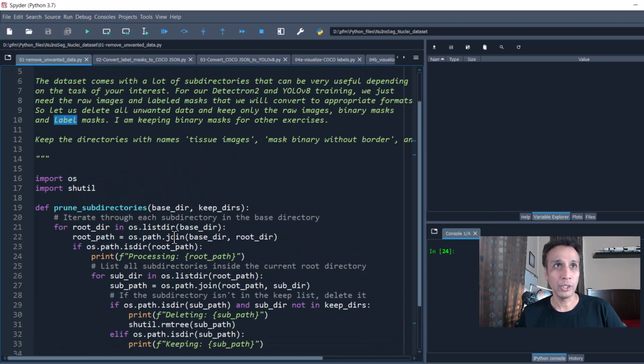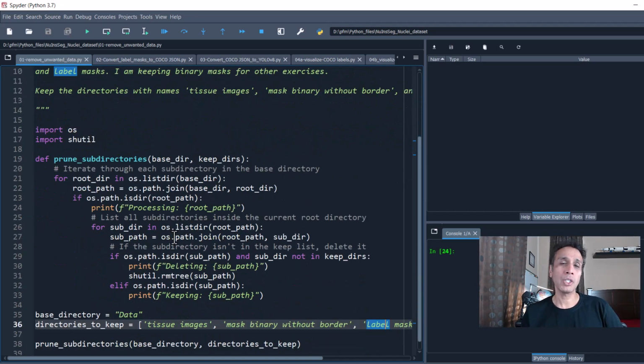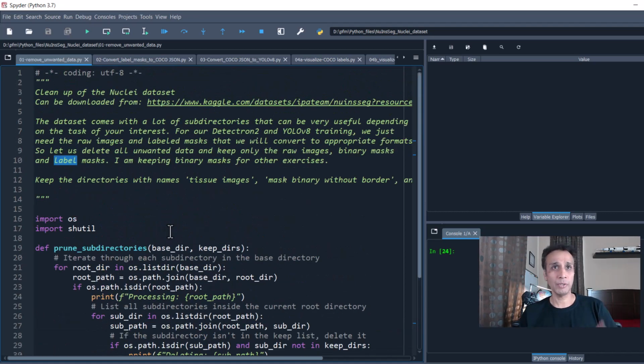You can take this and use it for other purposes. You can generate your own if you want. Just type a question in ChatGPT or something. I'm pretty sure it gives you code that's 90% there, and you edit it and get it working within 10 minutes or so. But if you don't want to waste that time, I have my code right here, that I'm going to share with you anyway.